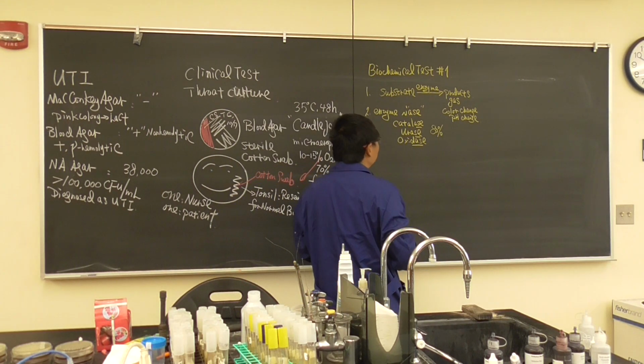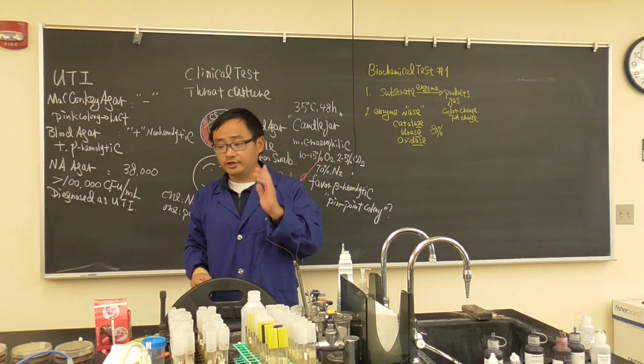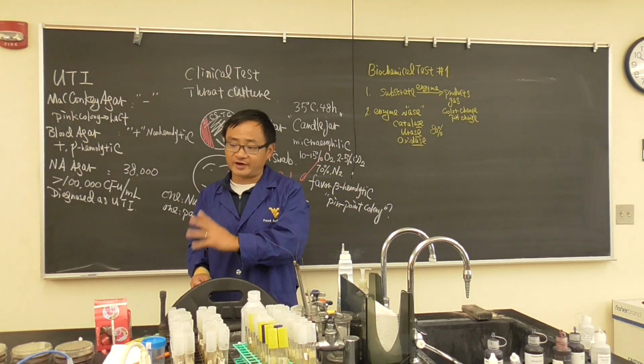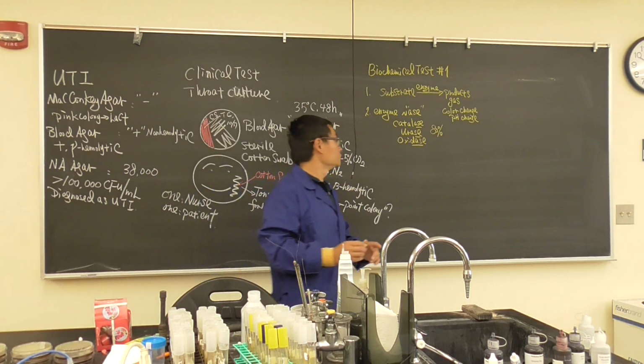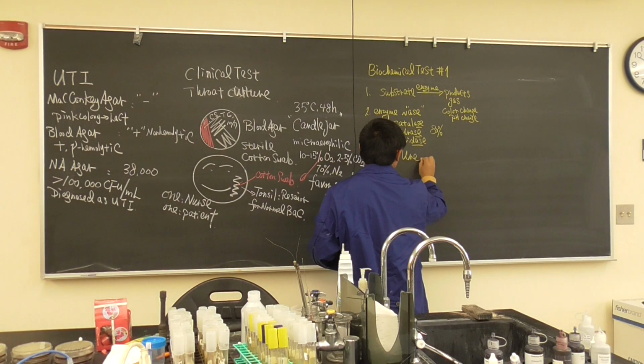Okay, for the testing today, we will do 2 tests. And there are about another 5 or 6 that we'll talk about later on. So today we will do number 1, the urea test.